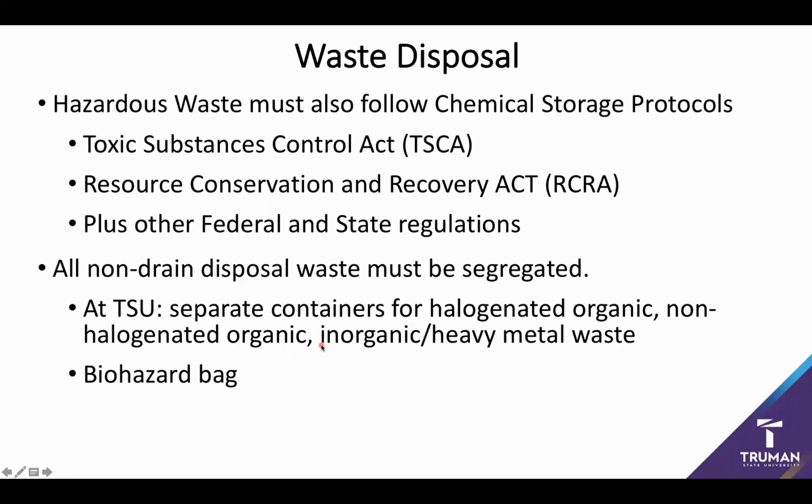And then we'll typically separate out our inorganic waste with our general heavy metal waste. And you'll often make use of a biohazard bag for toxic biological samples. But again, when in doubt of what to do with a particular waste or where to put it, ask.